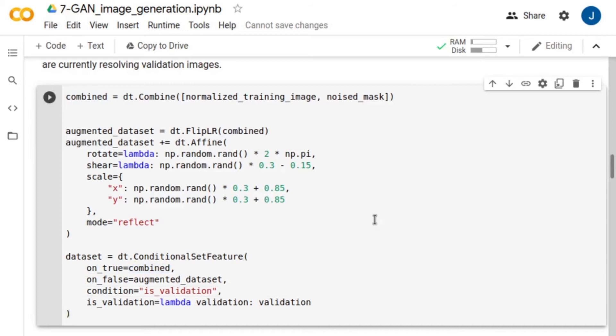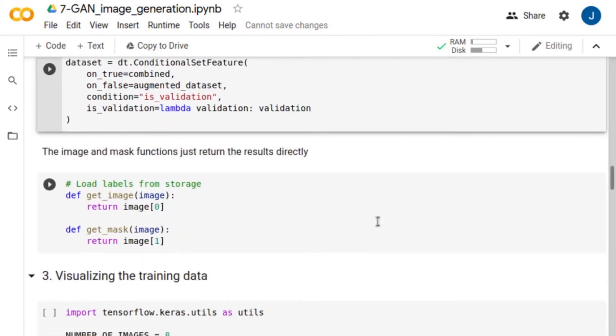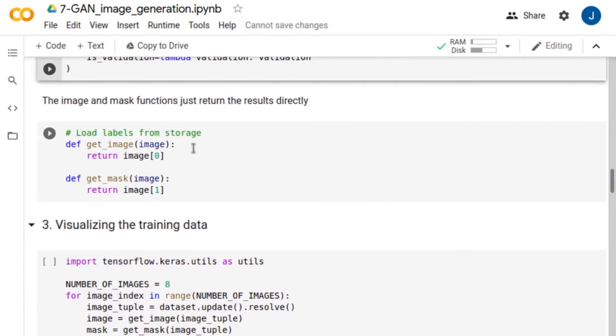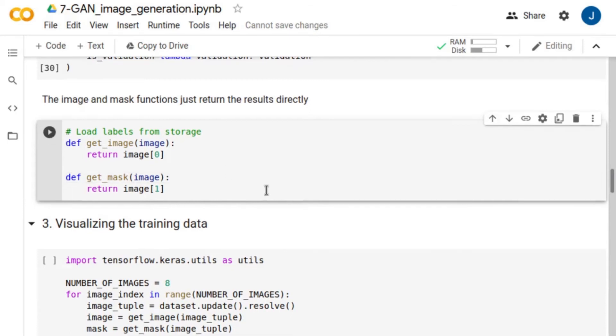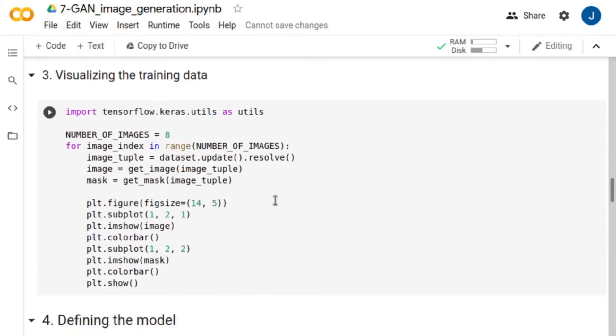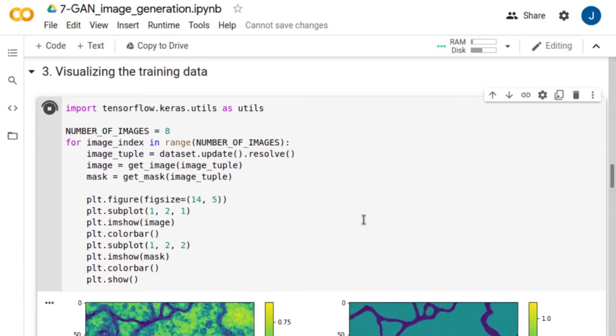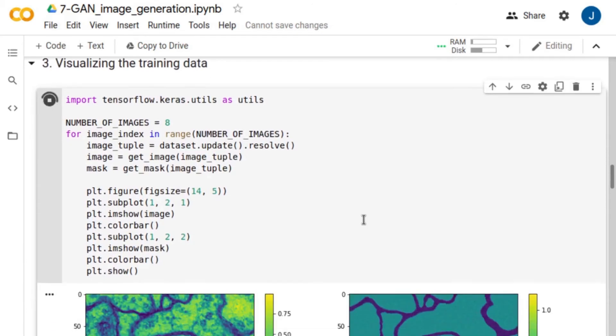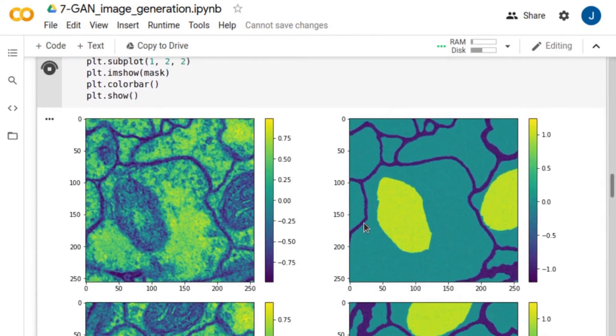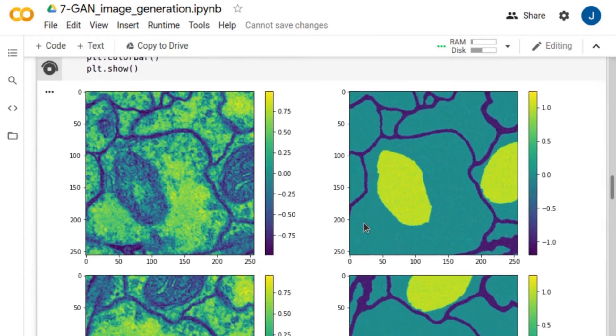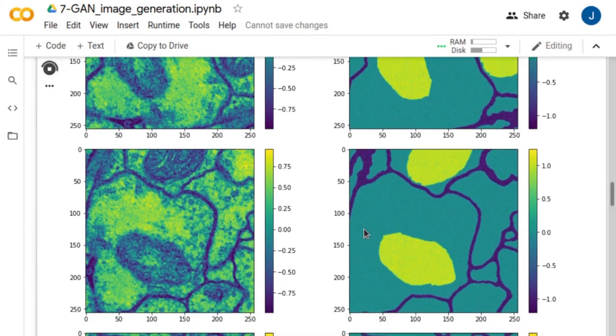Next, we define these two functions to retrieve the images and labels from the dataset. Let's visualize some image examples and their corresponding labels. Here, we show images and targets side-by-side.